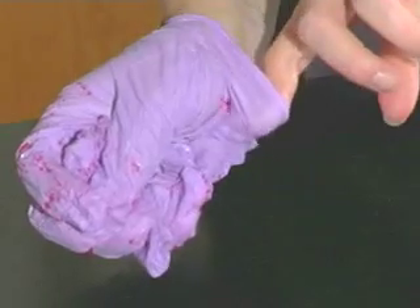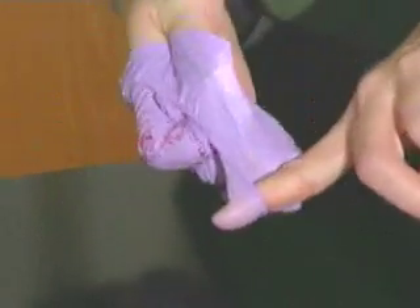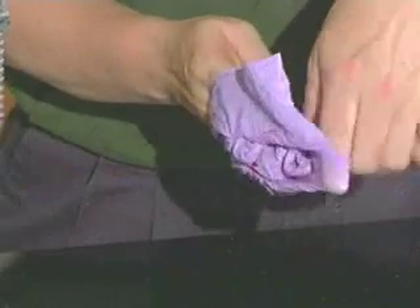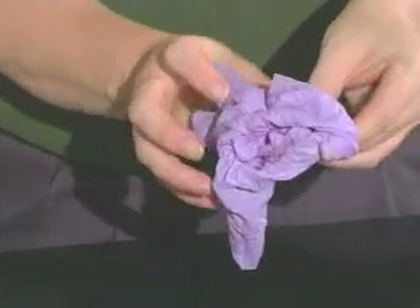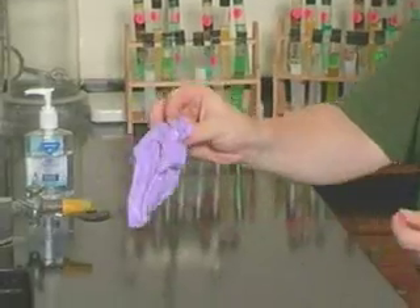Without touching the outside of the contaminated glove, carefully slide your ungloved index finger inside the wristband of the gloved hand. Gently pulling outwards and down toward the fingers, remove the glove inside out.